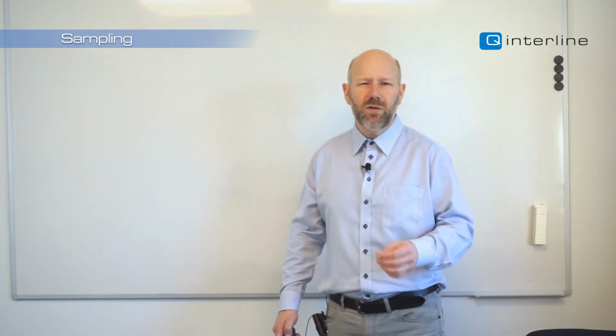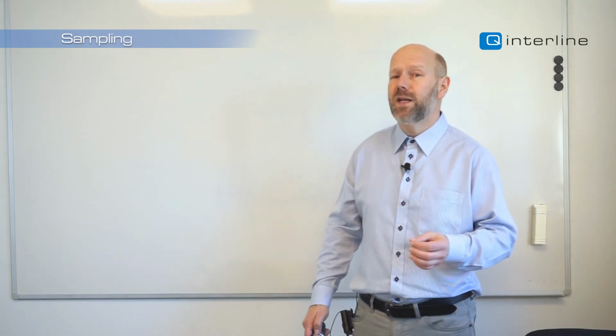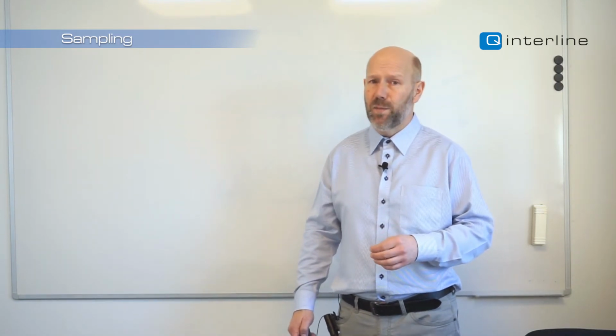Hello and welcome back to part 4 of the small series of videos on the topic of sampling from the e-learning from Q-Interline. In this video, I will cover taking a spectrum, which may seem trivial, but there are so many ways of taking a spectrum that it can be done very good and very bad.